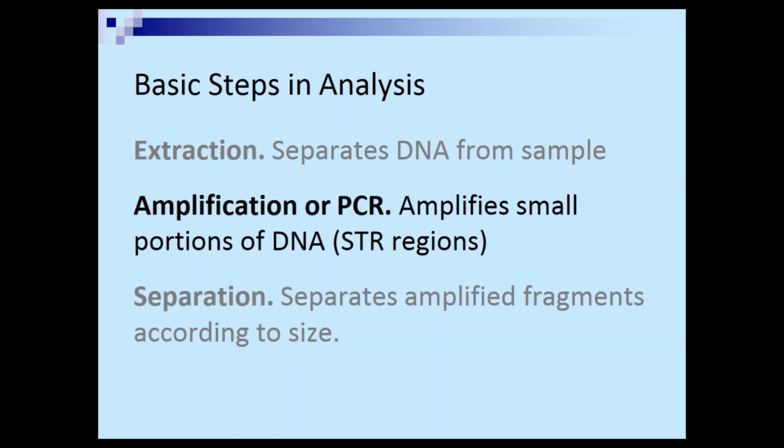So you're extracting all of the DNA from all 23 chromosomes. All right. If you have 10,000 cells in your blood sample that you started the extraction with, you now have 10,000 copies of each chromosome floating around and dissolved in that water. When you extract it, it usually breaks up into a bunch of different pieces, but that's not important. So what you need to do is, instead of 10,000 copies of that DNA, you actually need to only take about 350 copies, 500 copies or so, and squirt it into another tube.